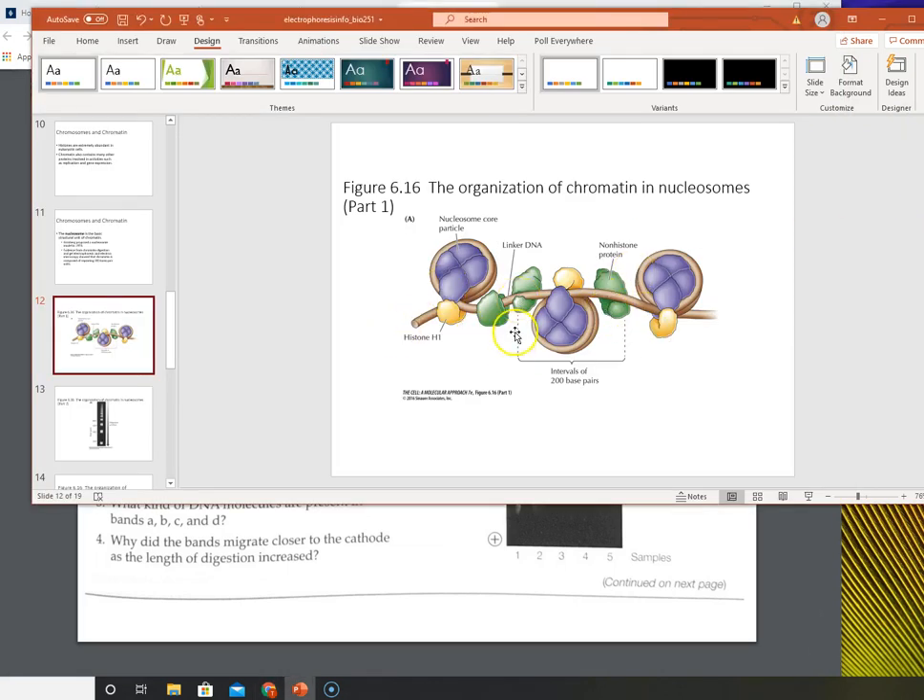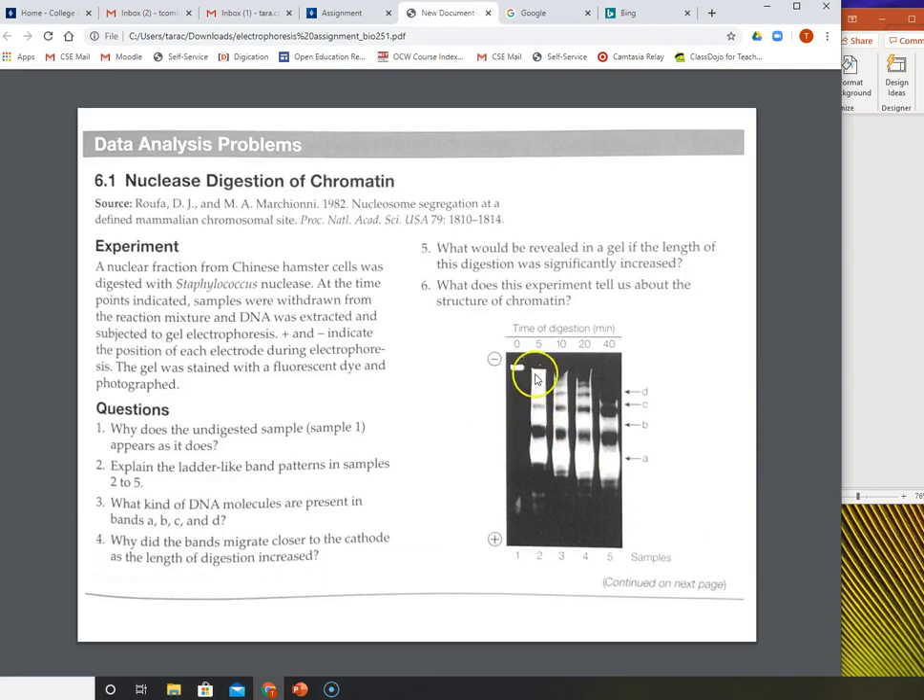If it's only a small amount of time, it's only going to cleave some of these. Imagine if you have a really long piece of DNA and you only get a couple cuts — you're going to have a lot of large fragments and maybe a couple smaller ones. You kind of see a lot of DNA still up here, but then you start to see some smaller fragments because it's being cut. Question two asks: explain the ladder-like band patterns in samples two to five. That's because the nuclease is cleaving the chromatin at those linker DNA spots, creating DNA fragments, and now you're starting to see those fragments on the gel as smaller pieces of DNA that can travel further down.